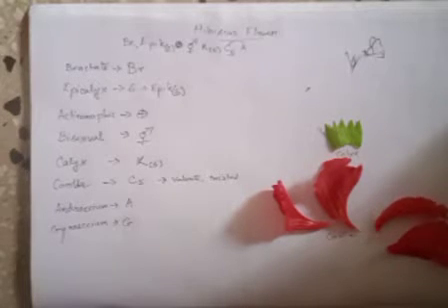So you see the androecium, there is an infinite number. It's like an infinite number of androecium, infinite number of pollens are there. So I can always write it as infinite androecium. Whenever I take out this androecium, I need to be very careful that I don't harm the ovary, or the white portion that you see, which is the style. I need to be very careful that I don't harm the style, because the style is very sensitive and would soon break.